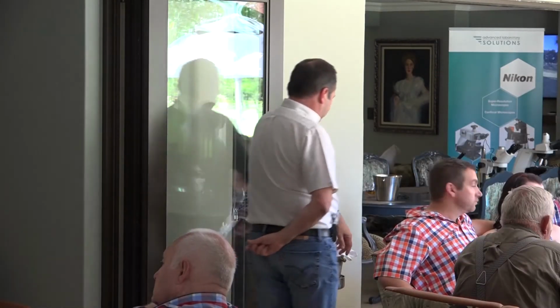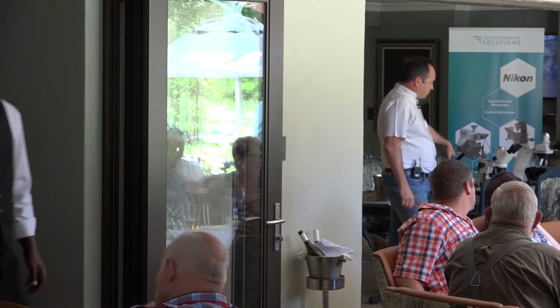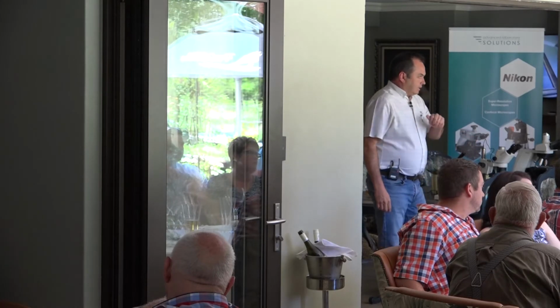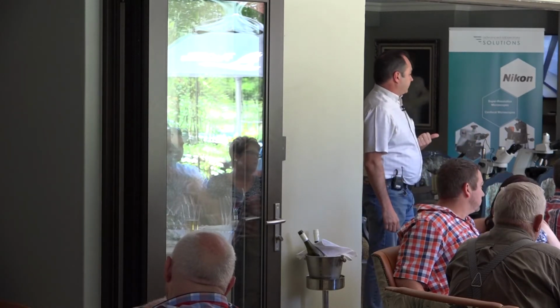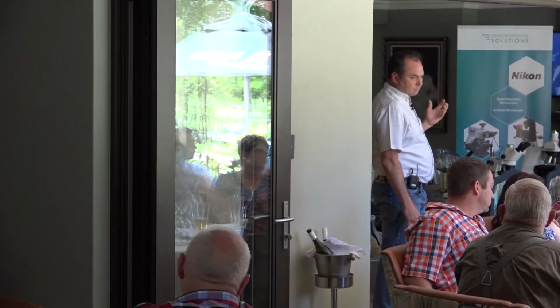The next thing I wanted to talk about was quite common, and I think, Kevin, you have one of those dedicated digital microscopes. They've become very popular, and they have an advantage. They're quite cheap. By dedicated, I mean that compared to these traditional microscopes, instead of having the head here with an eyepiece that you look through, you just have a camera mounted here and a screen on it. So these are quite common. There's nothing wrong with them. They work well.